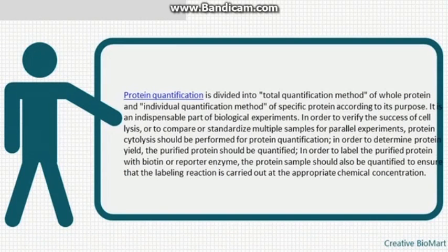Protein quantification is divided into the total quantification method of whole protein and the individual quantification method of specific protein, according to its purpose. It is an indispensable part of biological experiments.